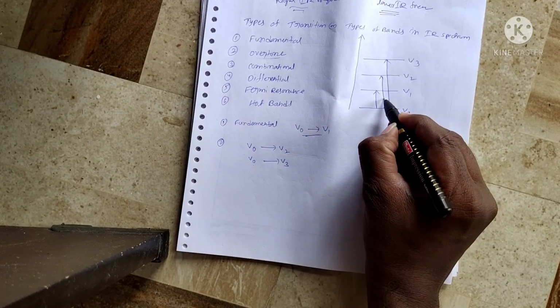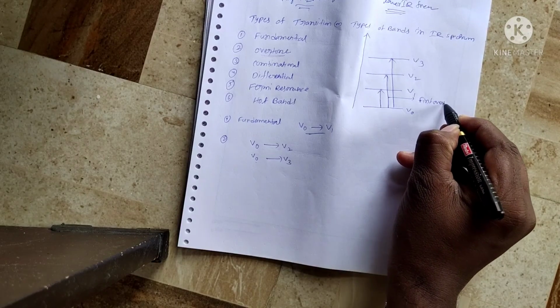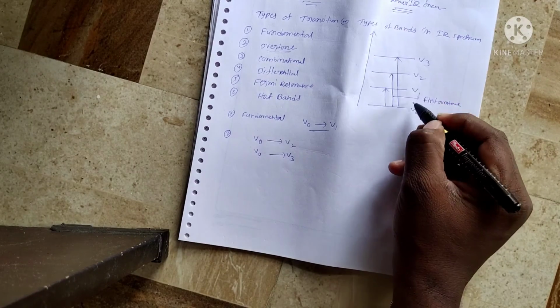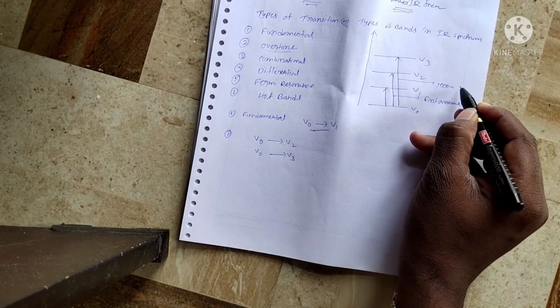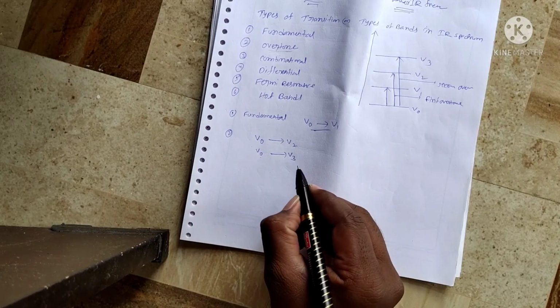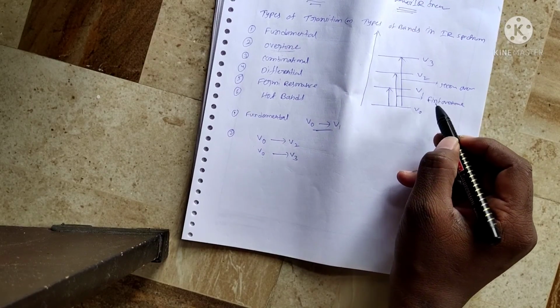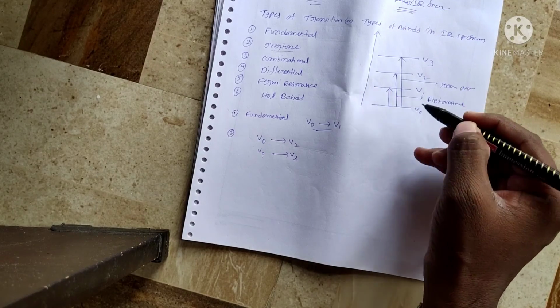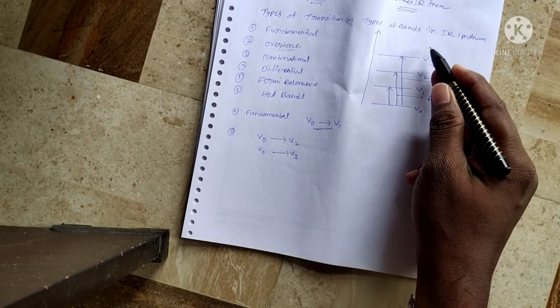V0 to V2 is the first overtone band, and V0 to V3 is the second overtone band. And V0 to V4 is the third overtone band.